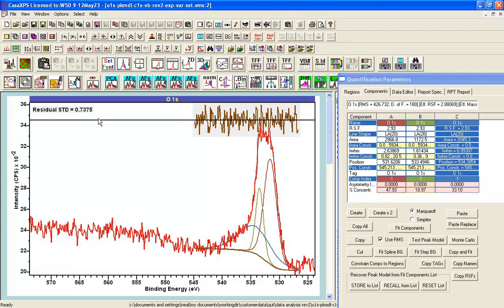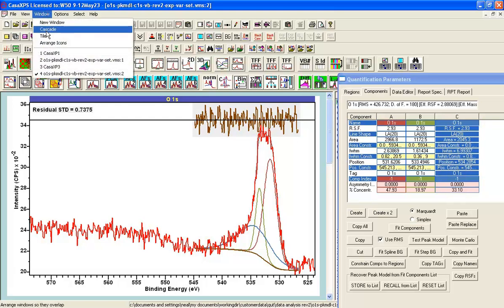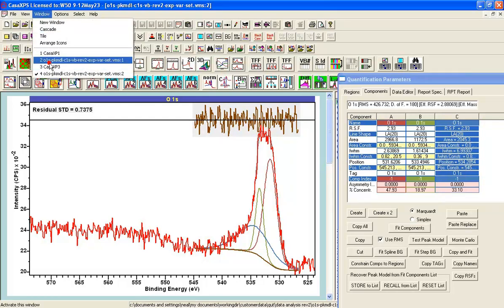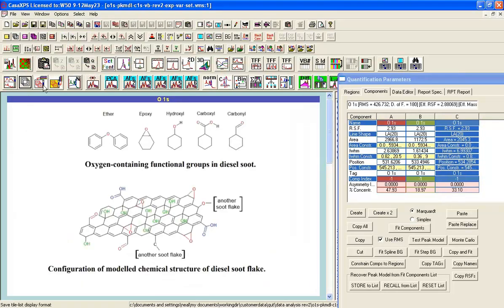But this is not a good way of constructing a peak model. One should always go back to the literature and consider what other people have done in the past. There seems to be some type of consensus around five different chemistries associated with soot flakes — though it's not entirely clear that this is the only story.